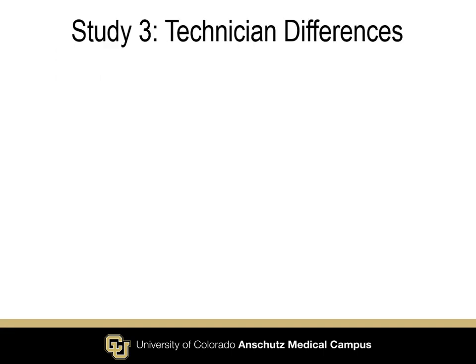Let's move on to study 3, which deals with technician issues. So a lot of us actually have several people working in our labs, and they don't always do the same extractions. So we don't have one person that is solely in charge of extractions, except for maybe in our lab, but that's a different story.